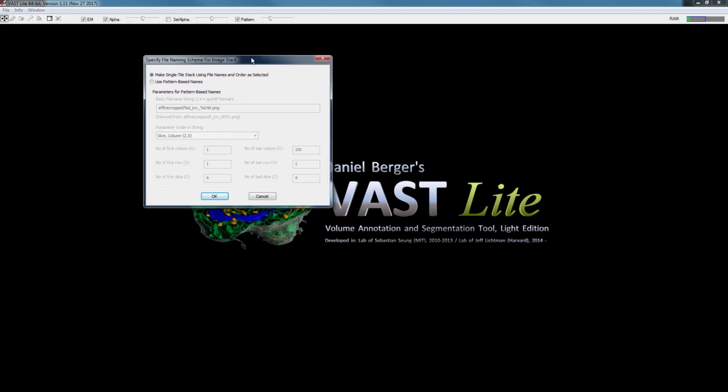Select Open. Now in this first dialog here you can select whether you want to just use the images as you were selecting them. So this is what I will do here. If you have larger stacks, then maybe you cannot have a single image per section. So what you would do is again tile them into smaller tiles, and then name those tiles in a way that Vast can access them. That would then be specified in this lower part of the dialog, but I'm not going to use that right now because this is a simple small dataset with one image per section.